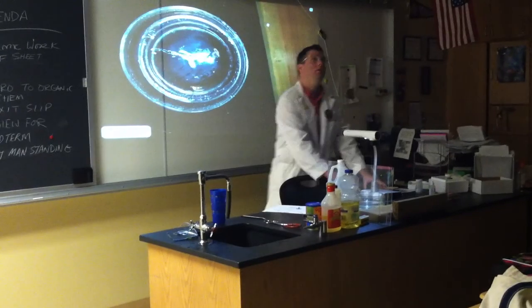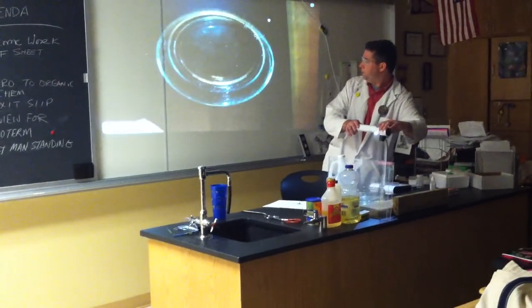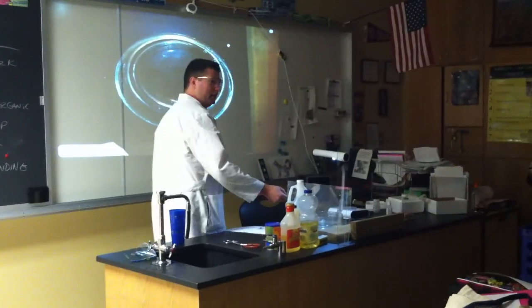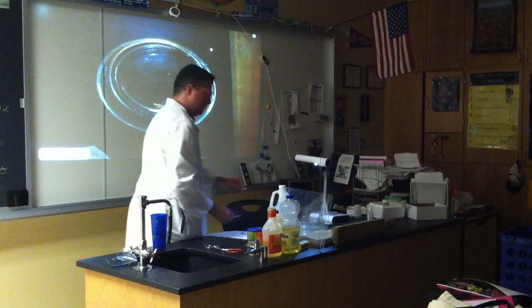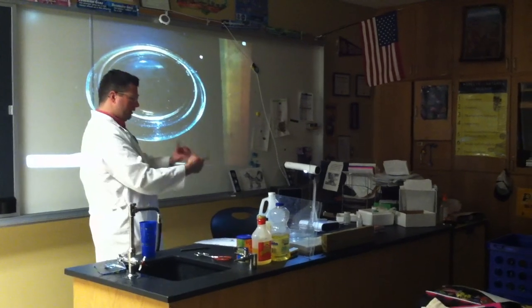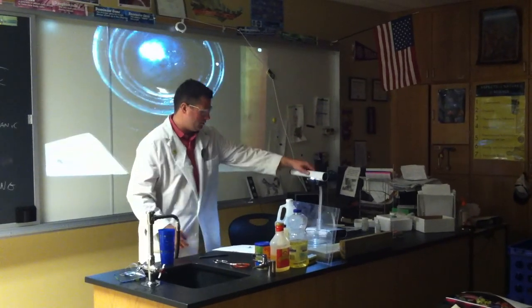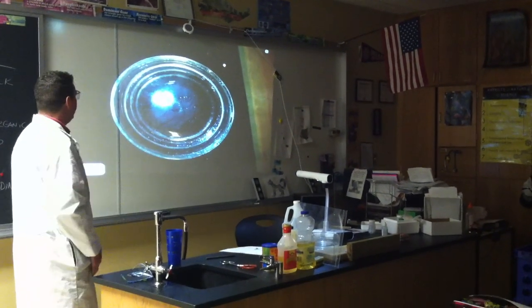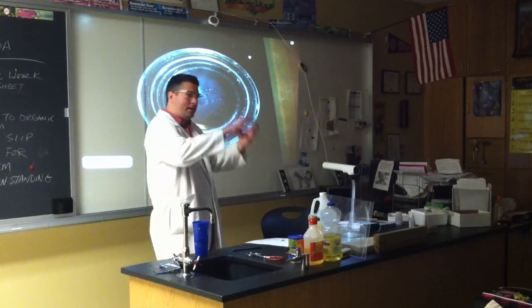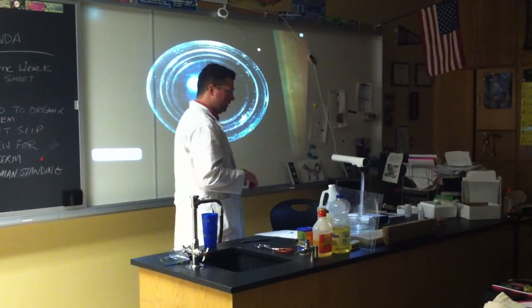All right. I might want to move this slightly out of the way so it doesn't pop up and ruin the camera too much. I'm going to start off with a small piece again, and you guys will see what happens here. So this is a lot more reactive. The other cool thing about this is it makes a sphere of sodium right on the top, and since this is small, it probably won't pop. But there's a lot more heat coming off of there. It's moving around quite a bit. Again, hydrogen gas is coming off. It's like spinning around there, so it's so reactive. And this is just a very tiny piece, even smaller than the lithium.